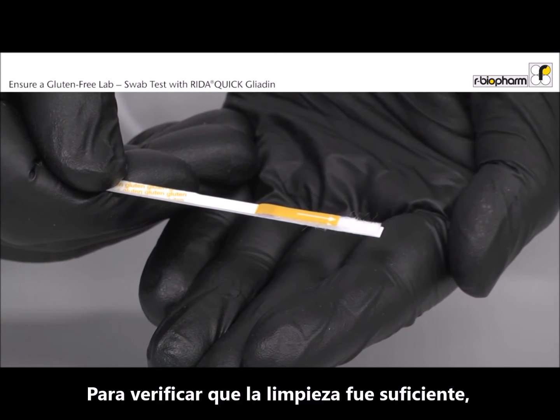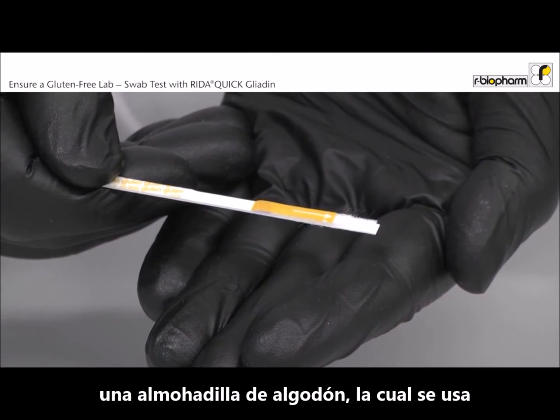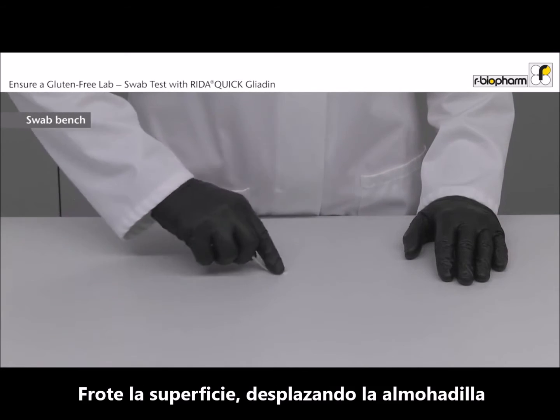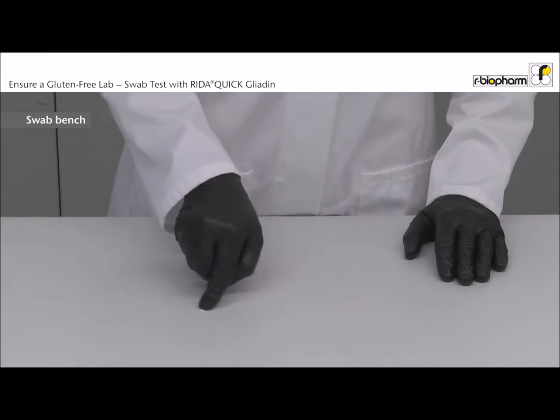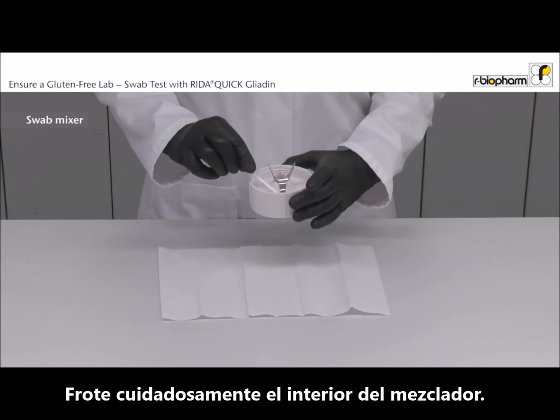To verify if the cleaning is sufficient, carry out a swab test directly with the dipstick. The lower end of the dipstick has a cotton pad which is used for swabbing the surface. Swab the surface while rotating the swab head in a crosshatch or zigzag pattern. Carefully swab the inside of the mixer.